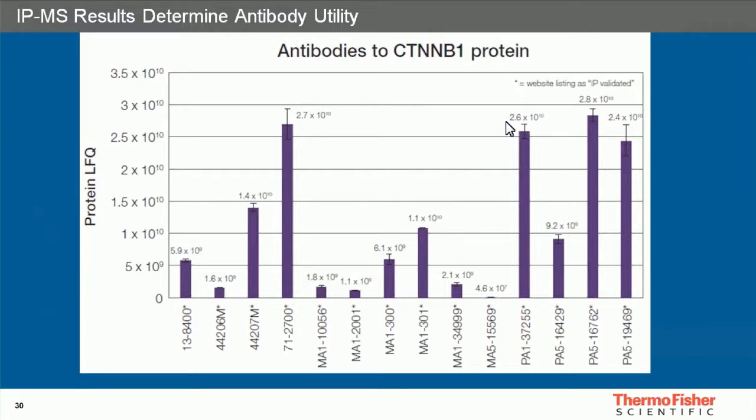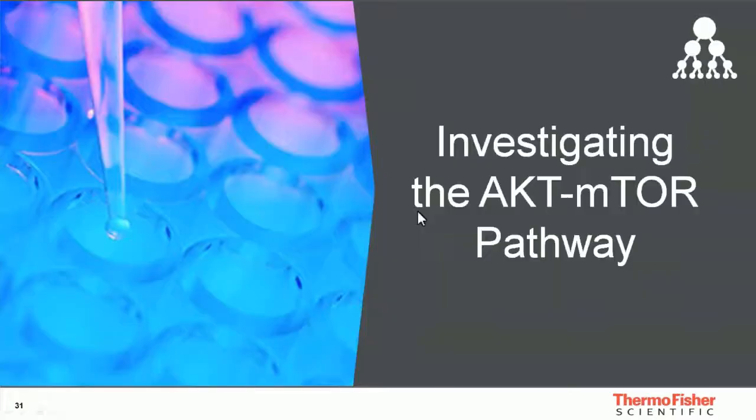Since we use this approach using the protein AG magnetic beads, what we wanted to do next is ask how we can select the best antibody, order them in a carrier-free format, and then do the streptavidin magnetic bead IP-MS validation.